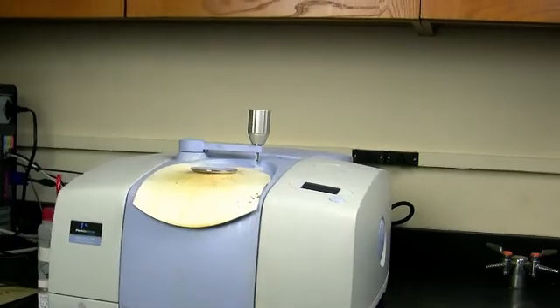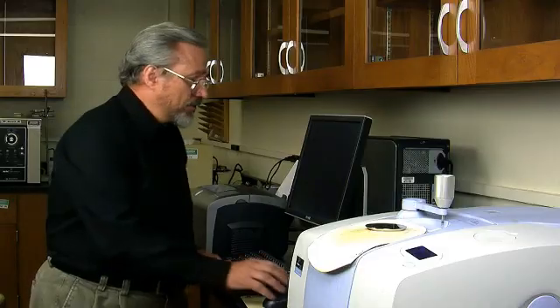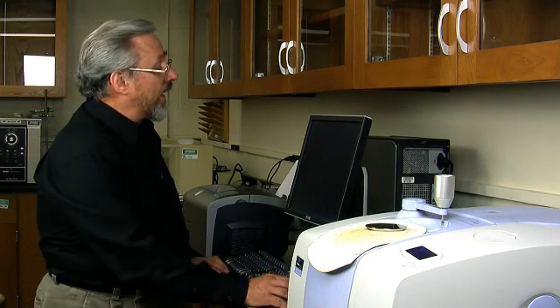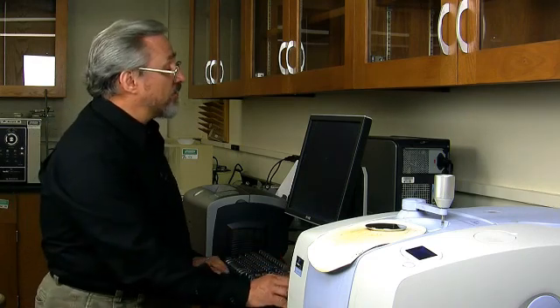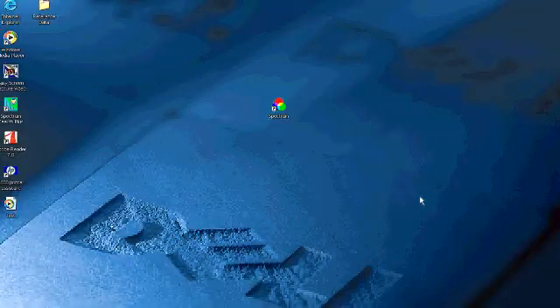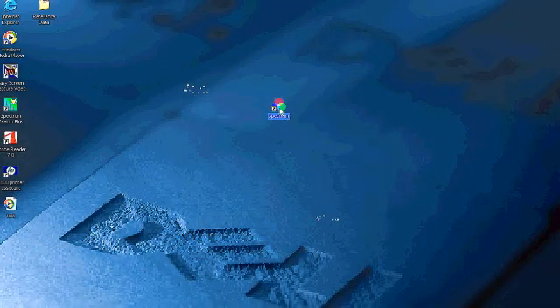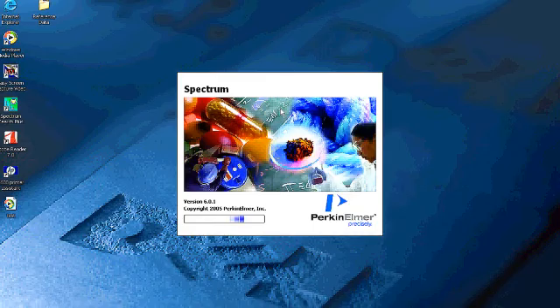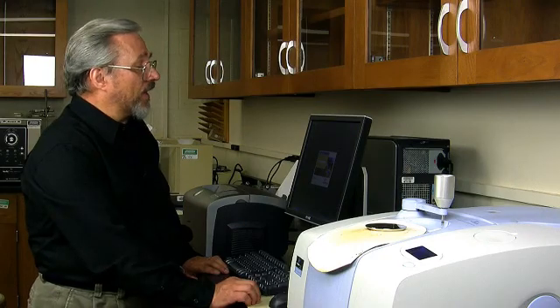The first thing we have to do is to turn the machine on, and the way we do that is through this computer interface. We go to the Spectrum icon on the desktop, and we click that with our mouse.